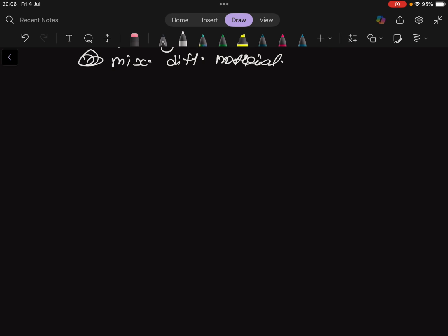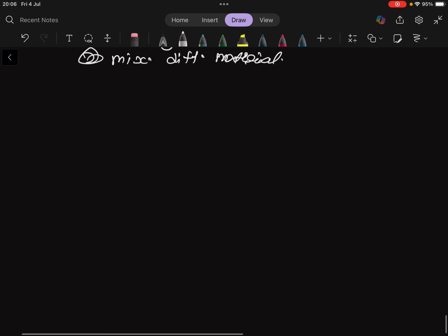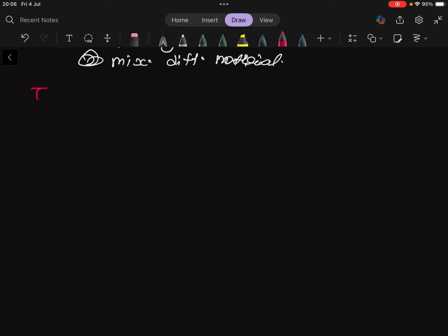So, what are the techniques which can be used for evaluating the behavior of the PCM material? We can use two techniques here.